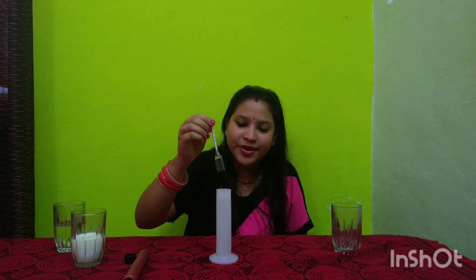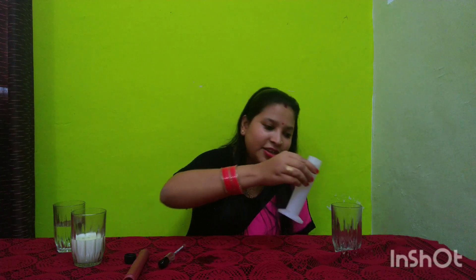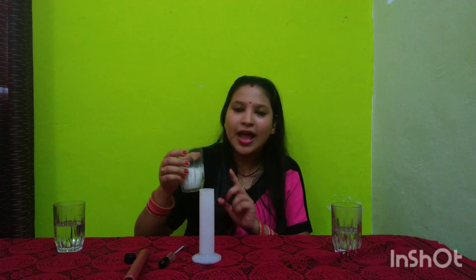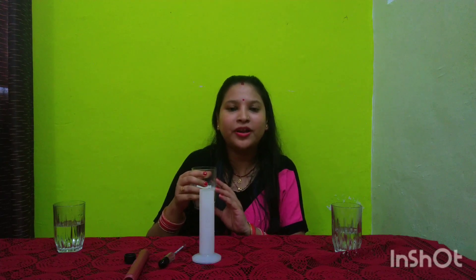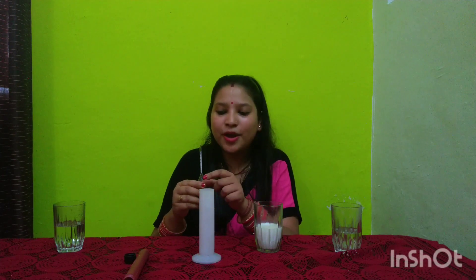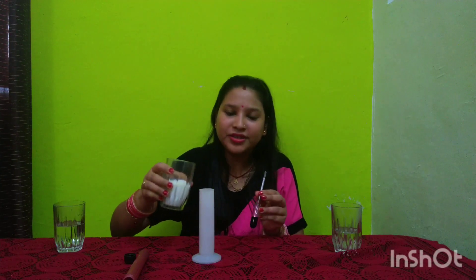Now, what we have to check with the lactometer is how much water is in the milk. I will add cow milk to the jar. If the cow milk is pure, the reading should be approximately 32 on the scale that goes from 0, 10, 20, 30, to 40. Let's check the purity of this cow milk.